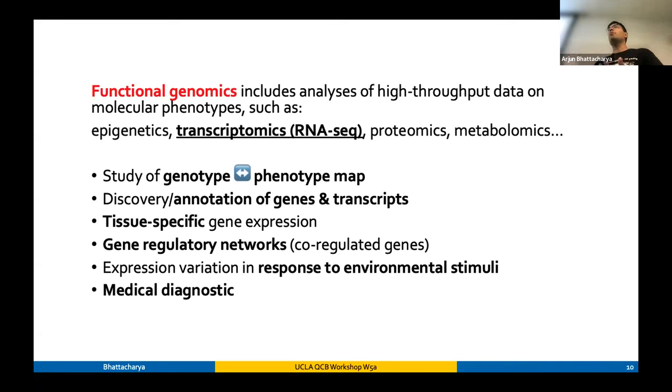There are, again, more broad spectrum concepts in transcriptomics. There's alternative splicing. How do different exons splice together? Where are those splice sites? Alternative isoform expression: genes have different transcripts that bundle together. How do we measure that? As well as different kinds of RNA sequencing technology. There's proteins, metabolomics, other kinds of things that aggregate together.